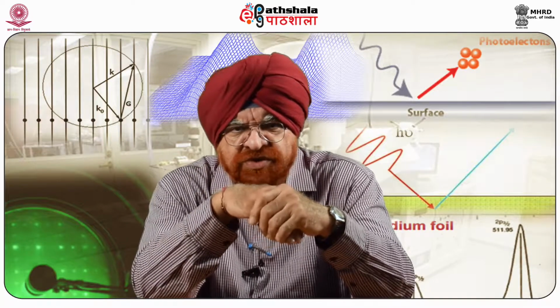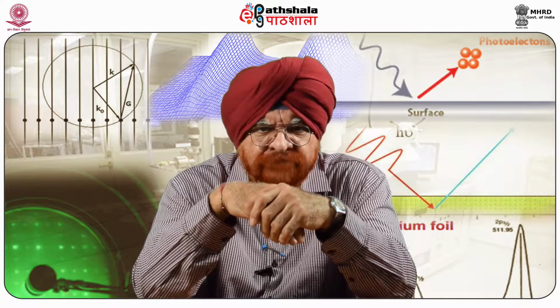The tip is placed close to the sample surface, from some nanometers to a few micrometers, and interacts with the stray field emanating from the sample. The image is formed by scanning the tip laterally with respect to the sample and measuring the force or force gradient as a function of position.